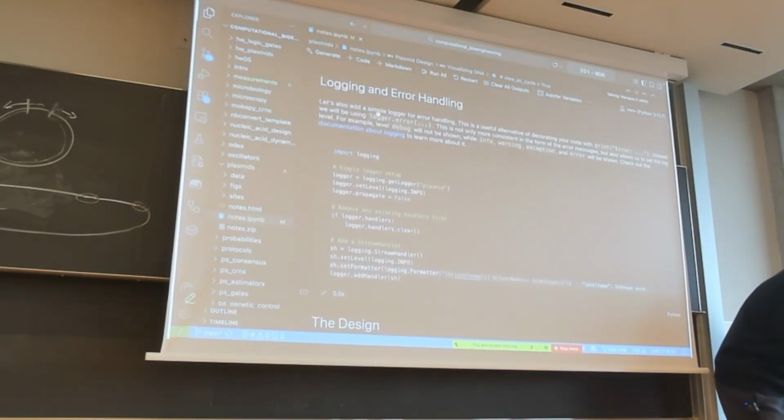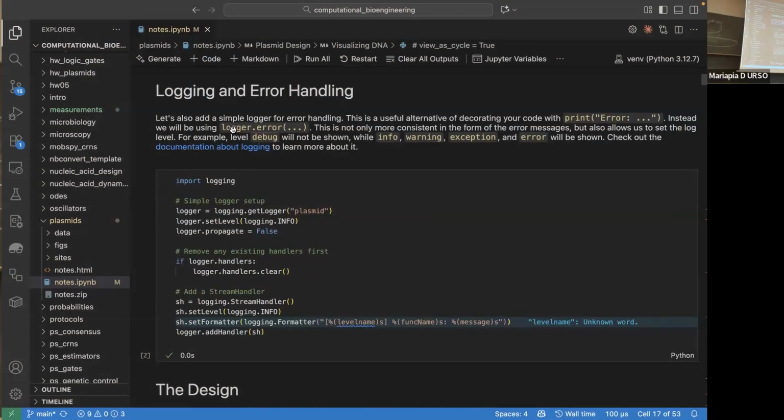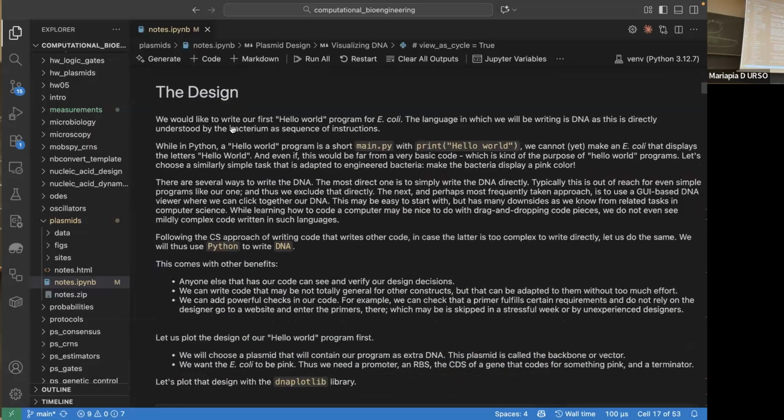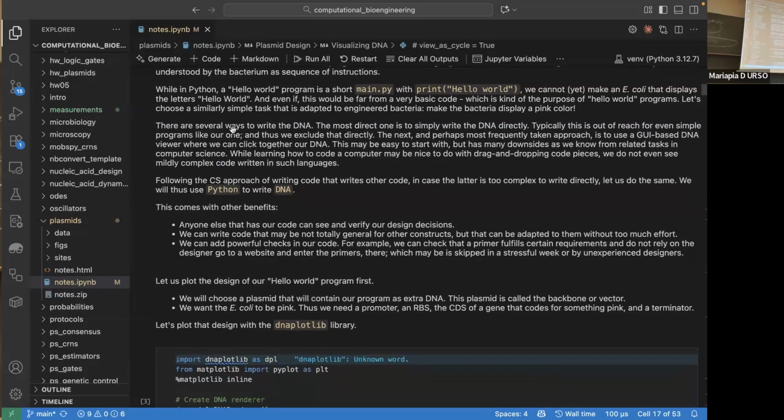Yeah, we will do also some digesting to this here. This is much more for you to read. We will also do some logging because our code will be a bit more complicated. So this is a nice habit, of course, instead of cluttering everything with prints.